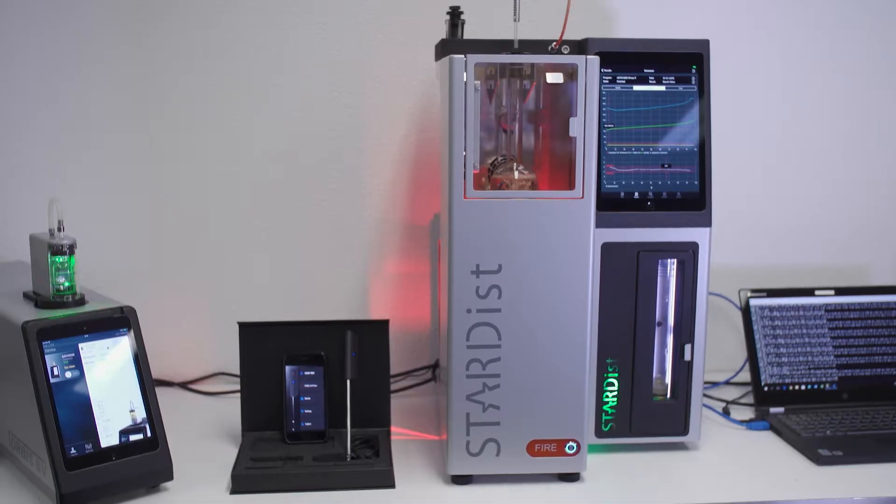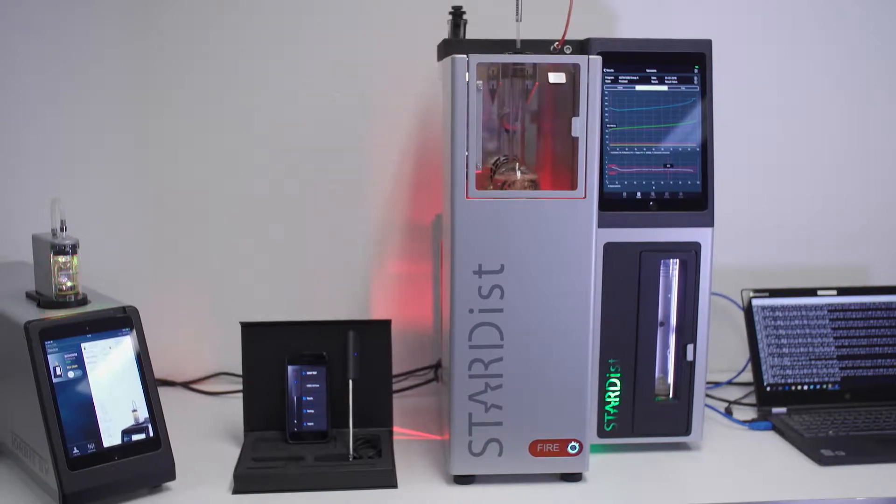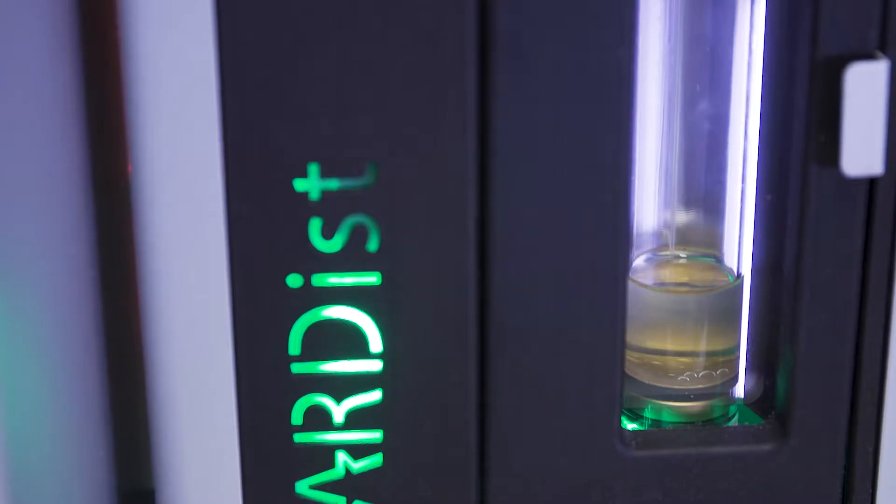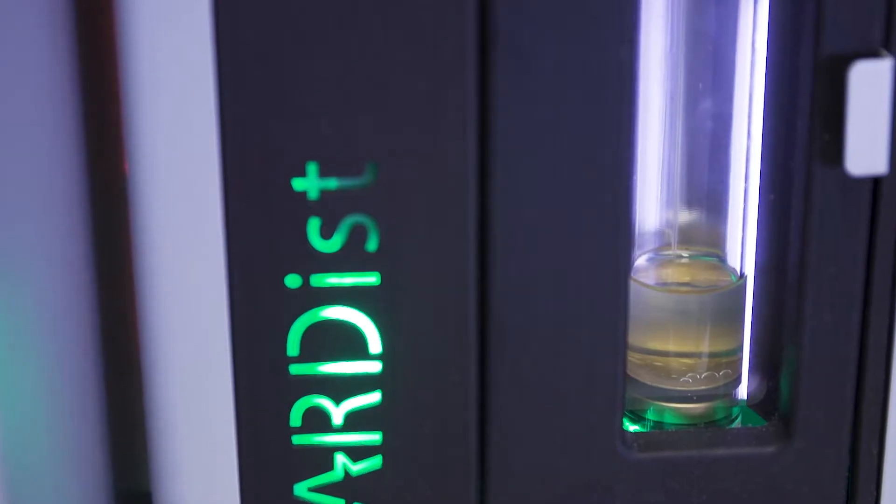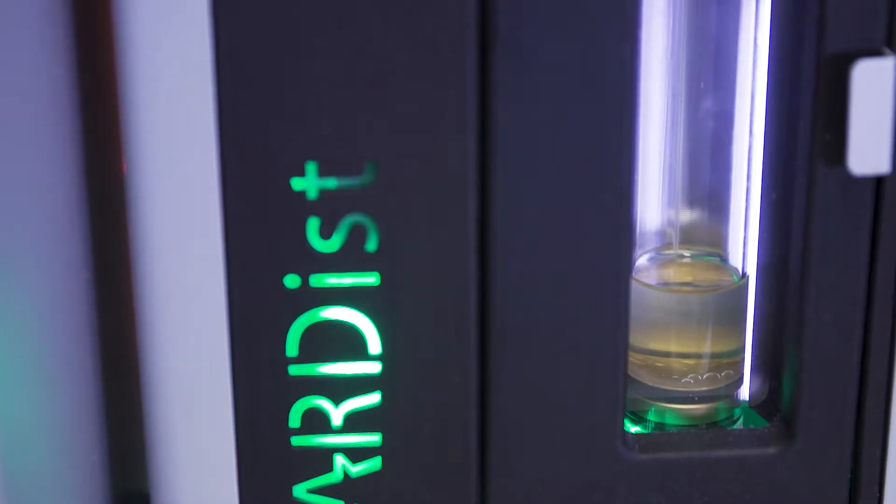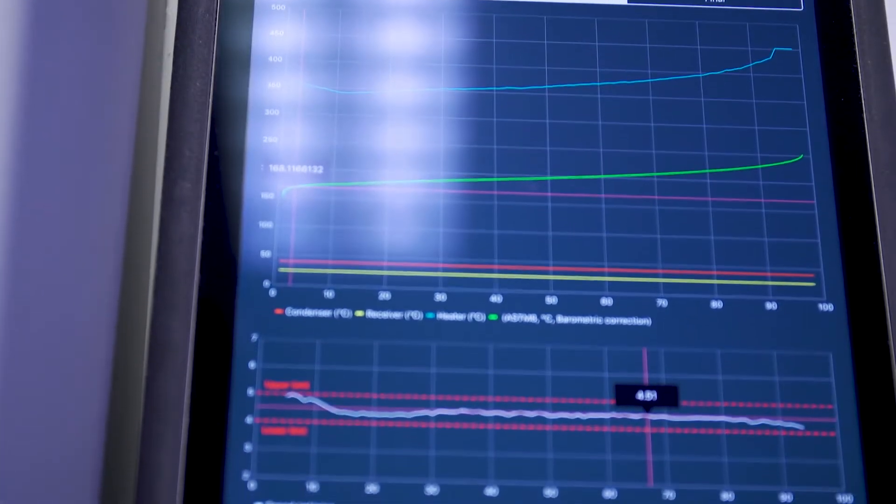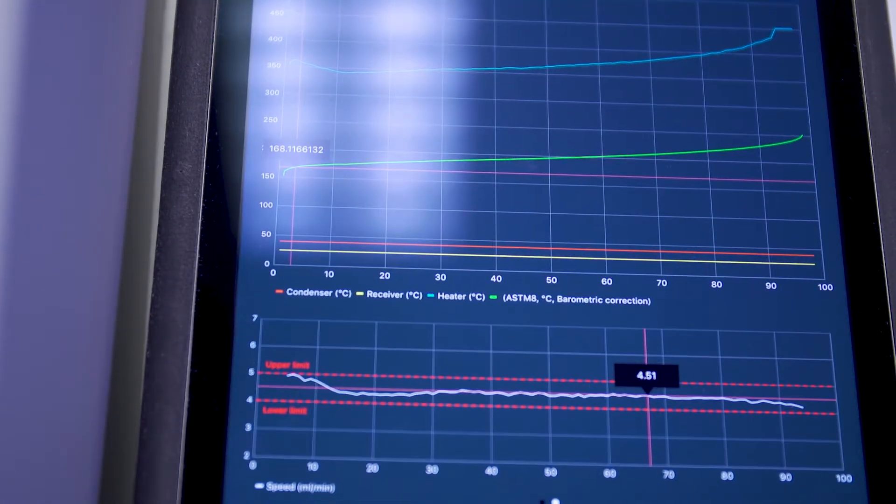The instrument on the right is Stardist. This is our latest development for automatic distillation testing according to the ASTM D86 method. We have included some innovative technologies and features to make the instrument more precise with higher repeatability and accuracy.